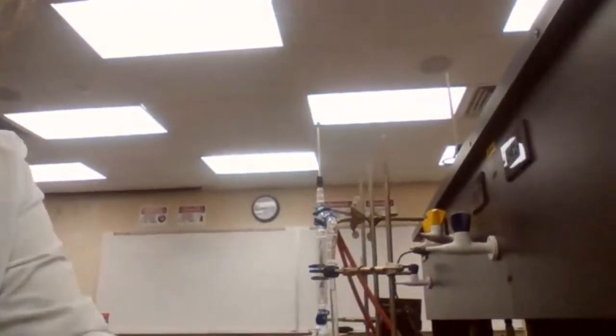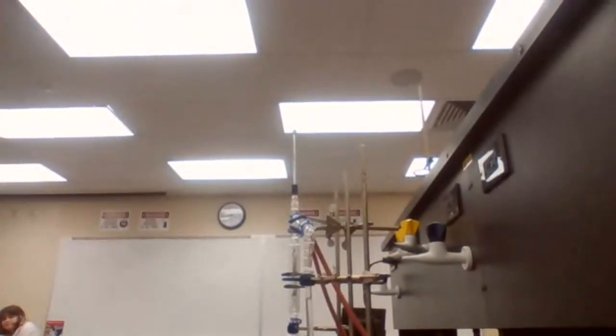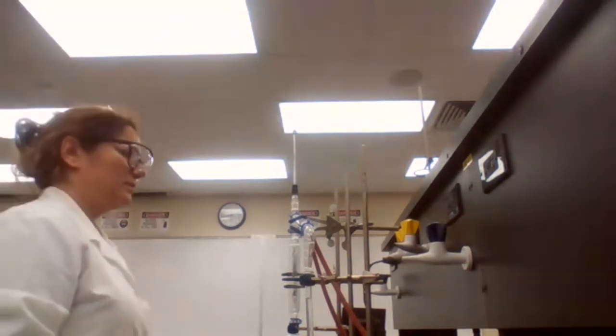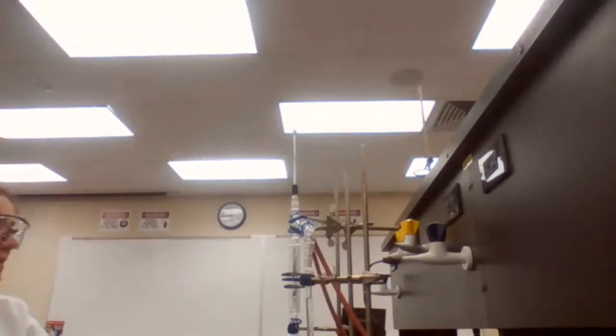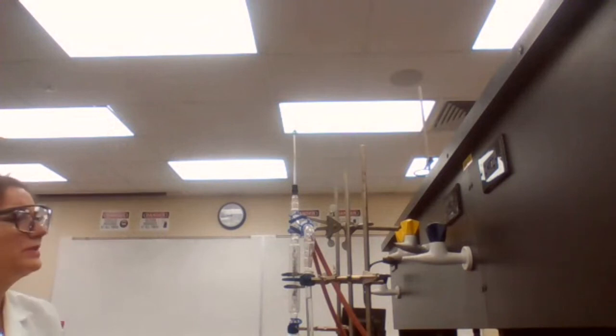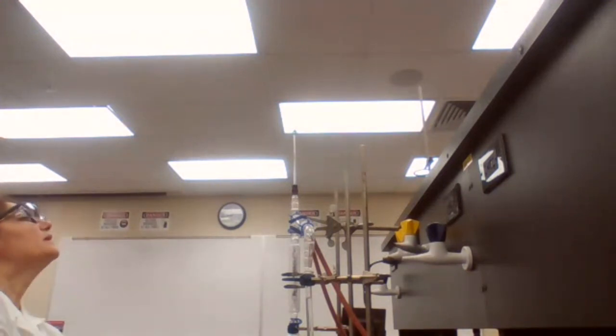It would be nice if you could take a screenshot. I actually held it up for you to see the fractional distillation earlier. And if you didn't take a screenshot or picture of this lab setup for the fractional distillation, I can hold it up again for you.